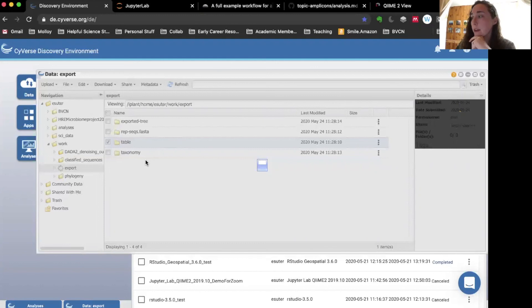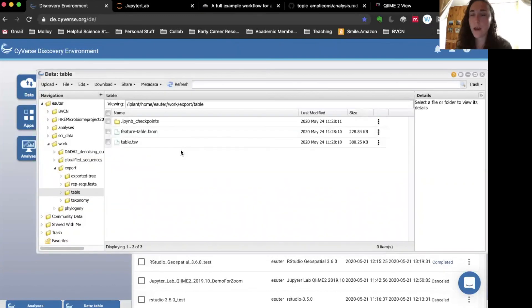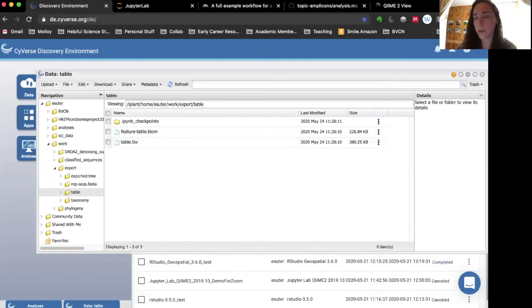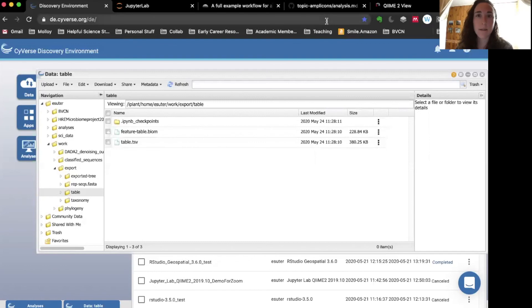I definitely recommend checking out the Happy Belly tutorial because it outlines in really clear detail the reasons why certain parameters were chosen, and I tried to replicate a lot of those here. I also explained them in the written tutorial for this QIIME 2 run-through on the BVCN website, so you can check that out too.